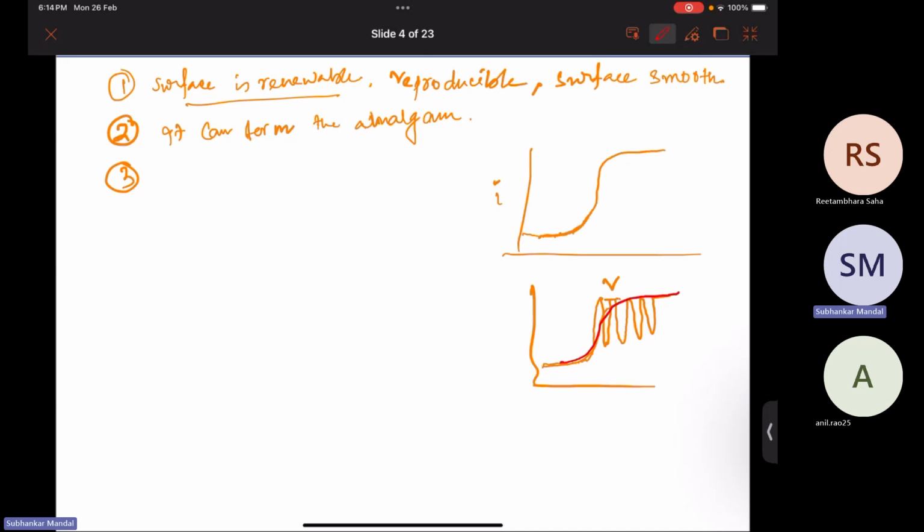Okay, so basically this is the diffusion current when the current value is happening. After that it becomes steady state, or slowly it increases. Why does it slowly increase? Can anyone tell? Or why after some time is it steady state? Can anyone unmute and tell? So this is slightly increasing, or it is steady state, and this is also steady state. Why is it steady state? Okay, so I can tell.